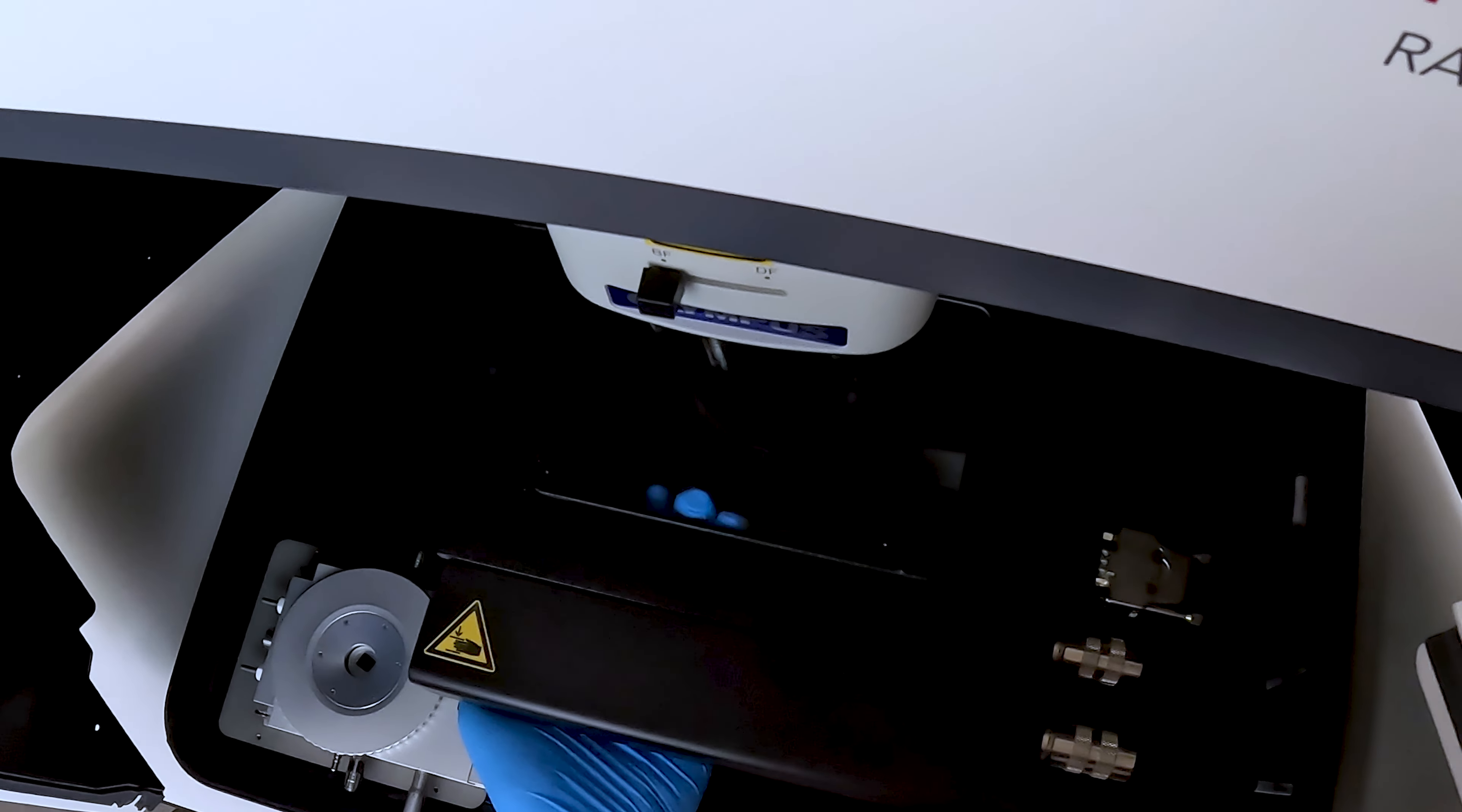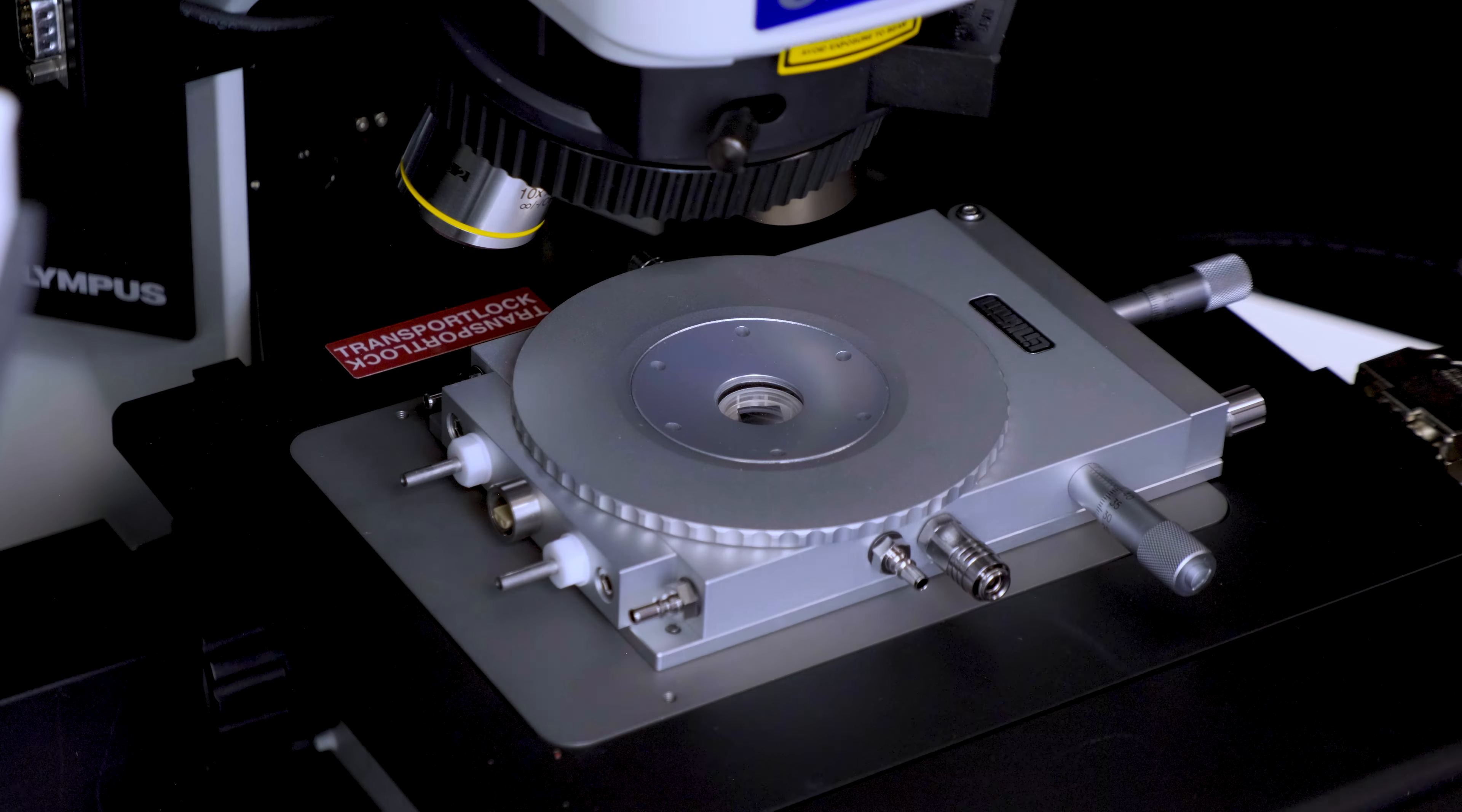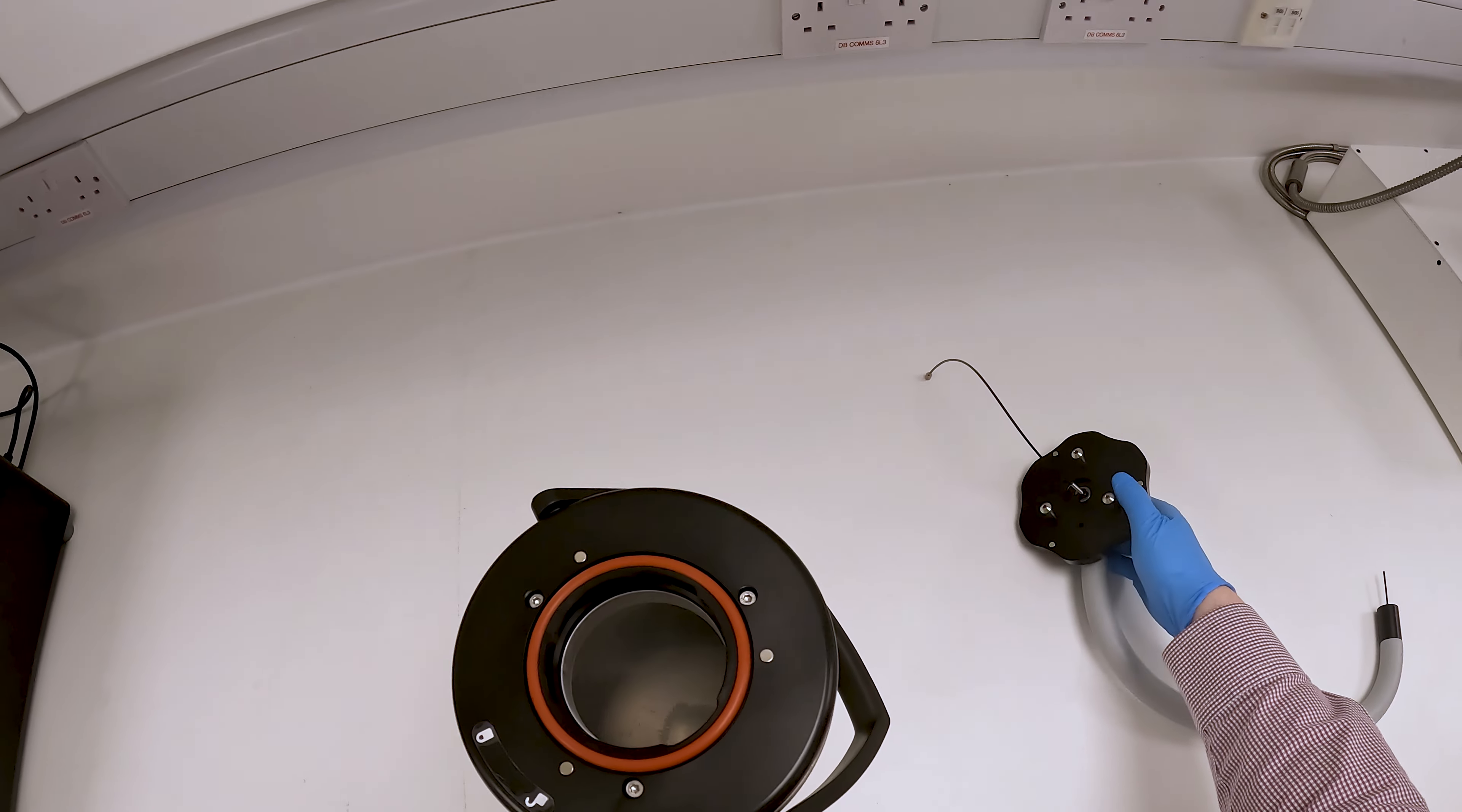The standard mount for the RM5 can just be lifted off. Next, fill the liquid nitrogen dewar flask with liquid nitrogen. Close the lid and ensure it is locked.